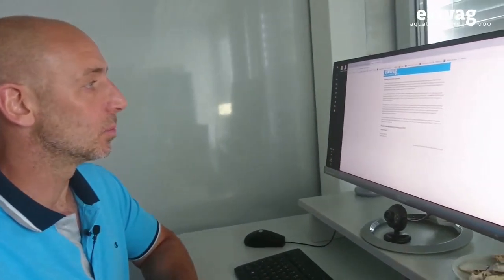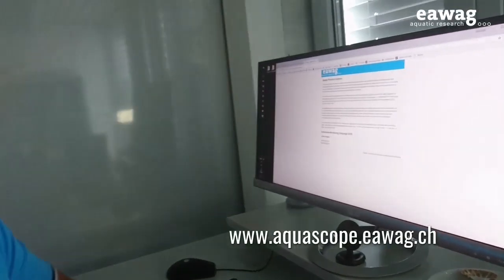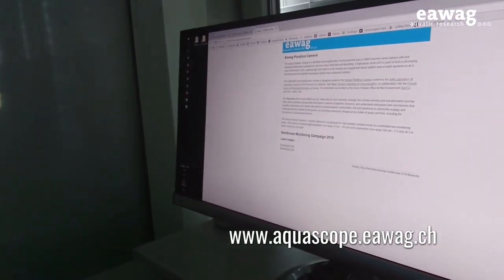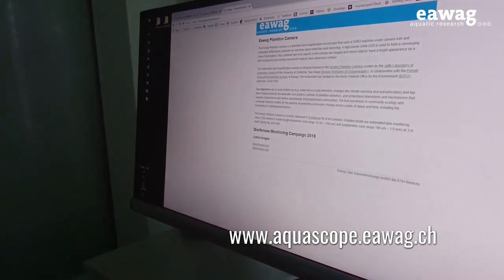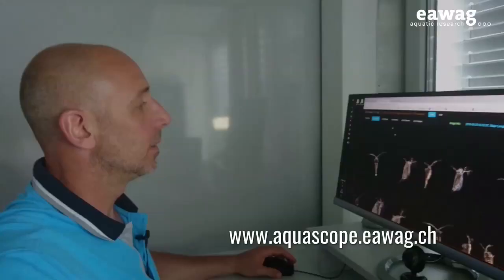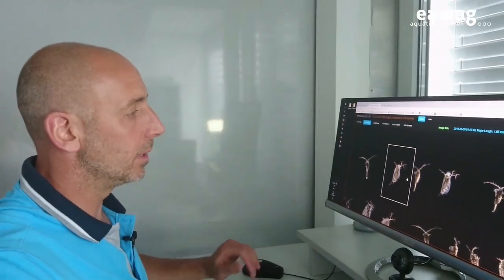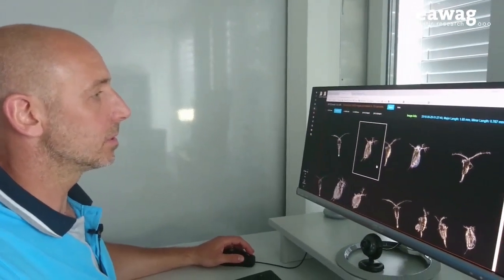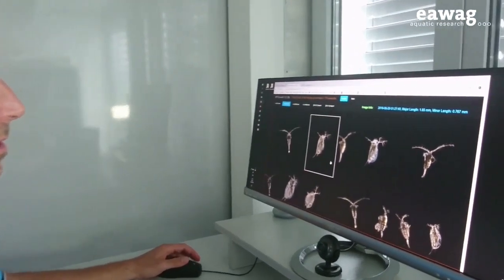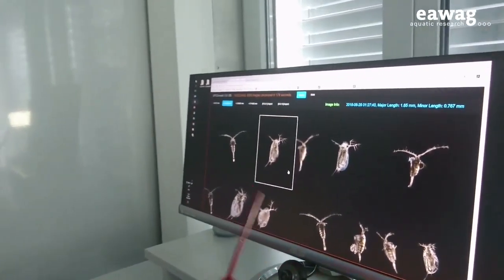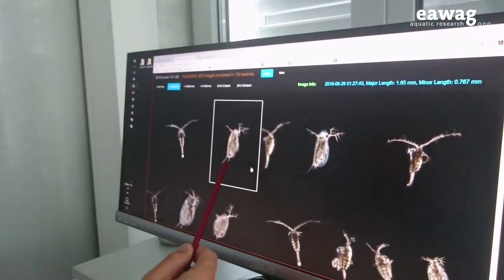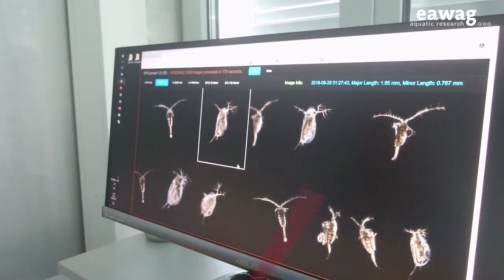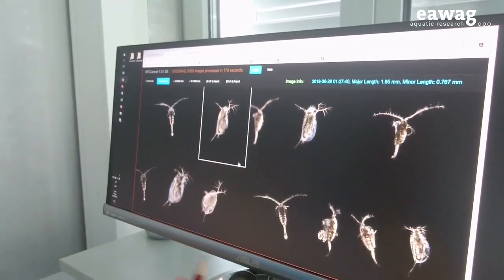This website is where we publish in real time the images from the underwater camera in Gryfensei. These are the low magnification camera images, and you can see, for example, the water flea daphnia, or different types of copepods — different species.